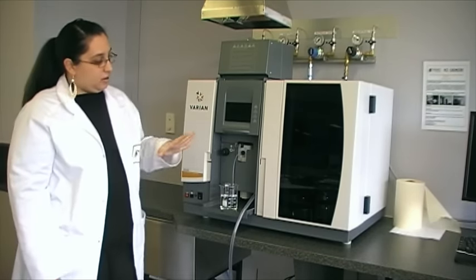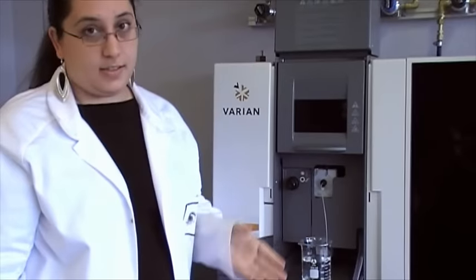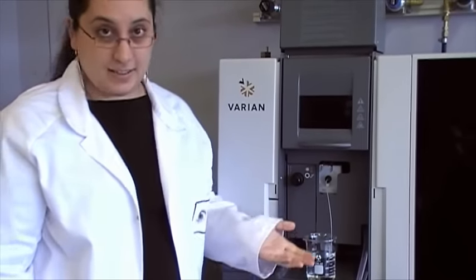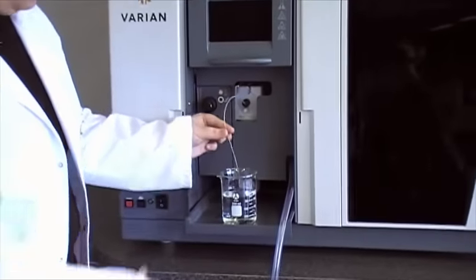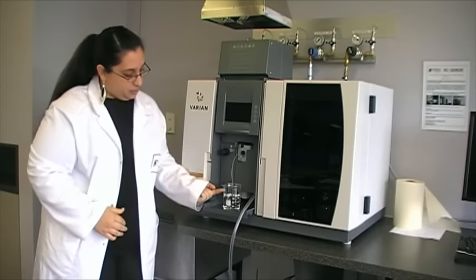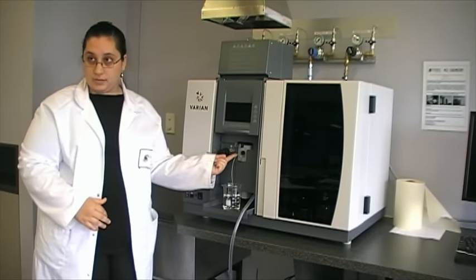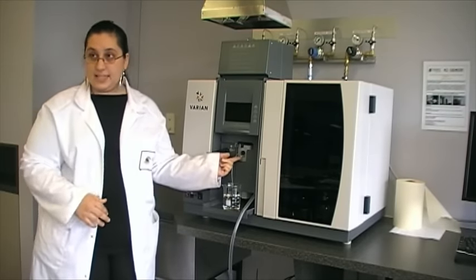So the first part of this type of analysis is to introduce a sample into the system, and that's done using this fine capillary tube. So our sample will be drawn up into this capillary tube and it's going to make its way into the nebuliser.